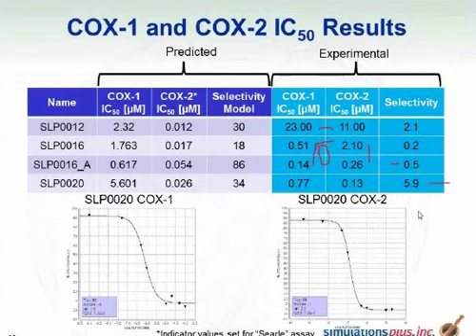We're taking data from somebody else's assay, designing compounds, and then the assay that Sarep performed was actually a 4th variation on the assay, so it wasn't exactly similar to the Merck or the Searle. Here I show the dose response curves for the SLP20 compound, and this is against a percent control, but you'll see down at the bottom that we are achieving 100% inhibition relative to the control, and that this bottom part of the curve is nicely flat and well formed.